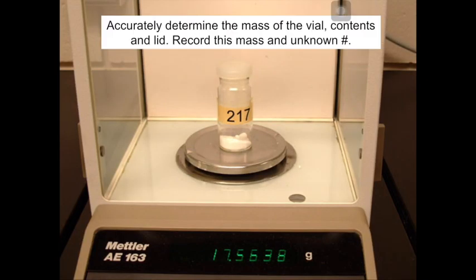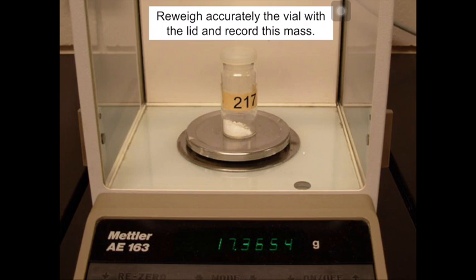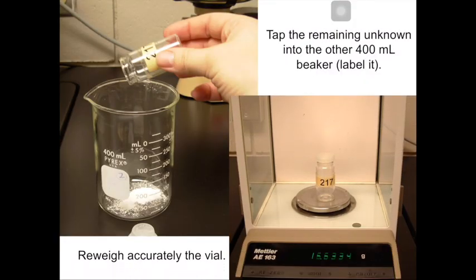Furthermore, accurately determine the mass of the vial, contents, and the lid. Record the mass of the unknown. This one is your unknown sample that is given to you. Transfer a certain quantity of the unknown sample into your beaker and reweigh the vial accurately with the lid, and record its mass in order to determine the amount of solid that is being transferred. This one is for this experiment. Tip the remaining unknown into the beaker and label it. Finally, reweigh the vial afterwards in order to determine the amount of sample that has been transferred.